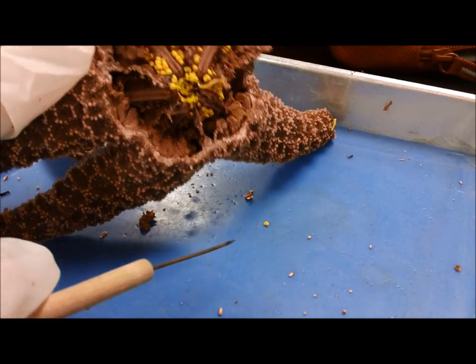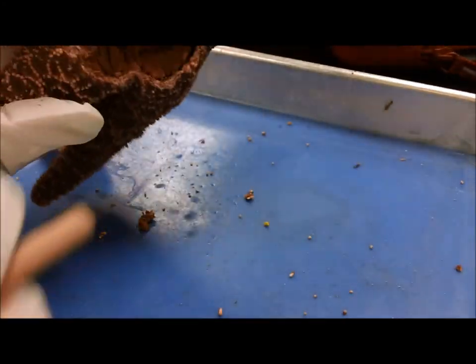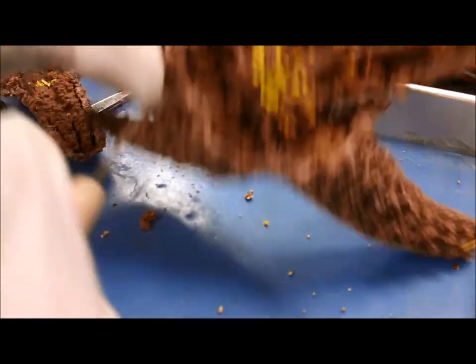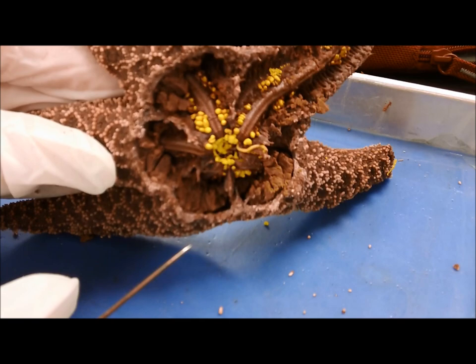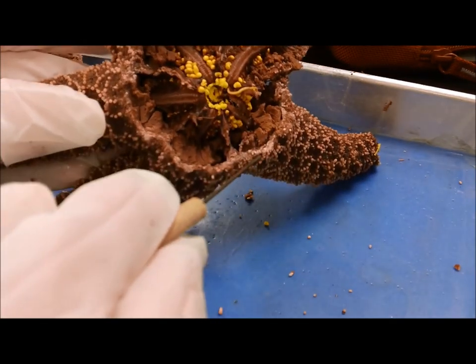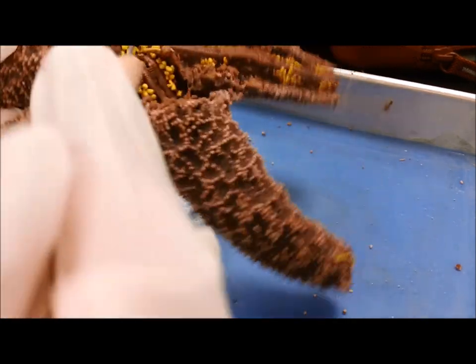Probably a better dissection than you guys would have done yourselves. But it's kind of interesting how full of intestines each of these arms is. Is there anything inside that would show it was mechanically harmed internally? Do the intestines look very full in there?